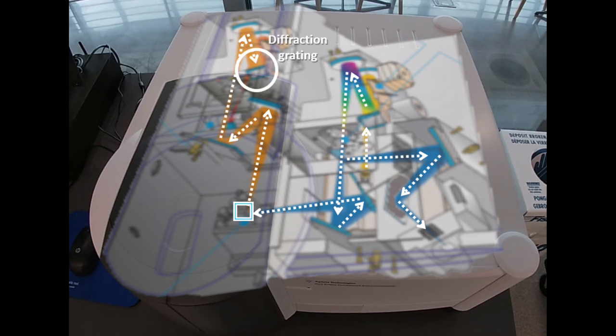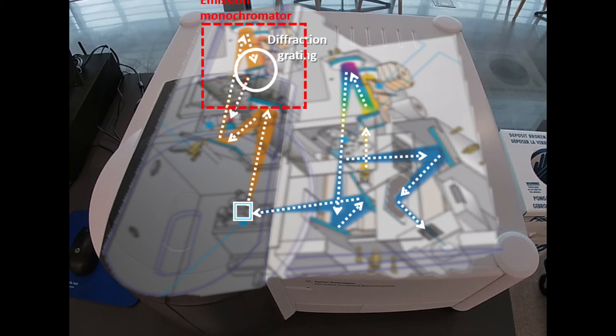That fluorescence emission moves through a few other optical devices to focus it on a diffraction grating, which is our emission monochromator, where we can optimize the wavelength we observe.